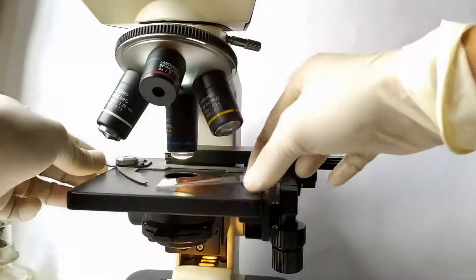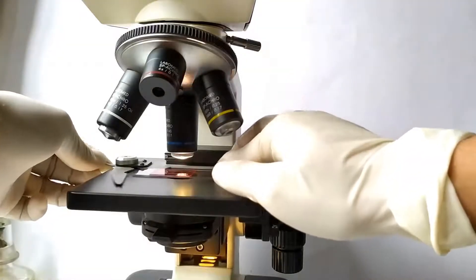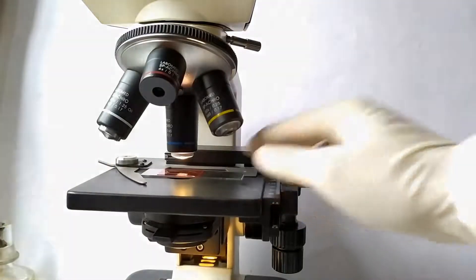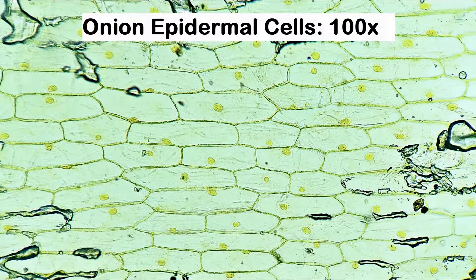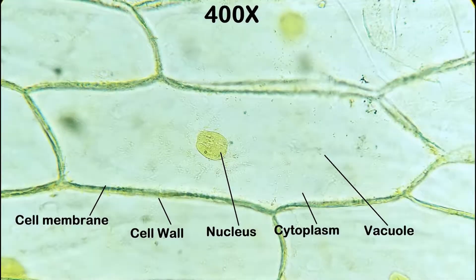Observe and study the onion peel under low and high power of the microscope. Onion epidermal peel is composed of numerous, compactly arranged, elongated and roughly rectangular cells. Each cell has a deeply stained spherical nucleus and cytoplasm that surrounds a large central hollow vacuole.